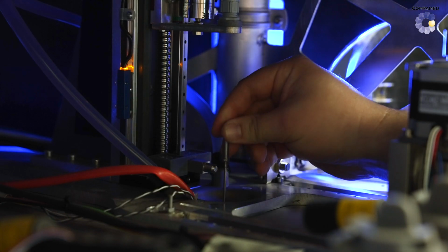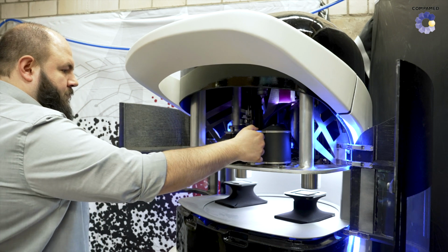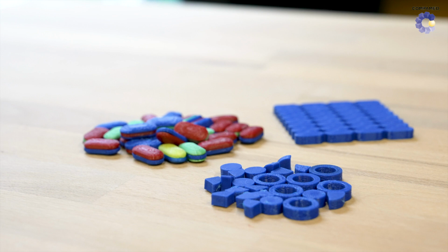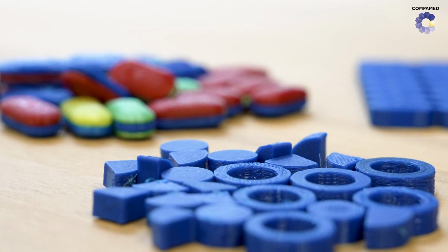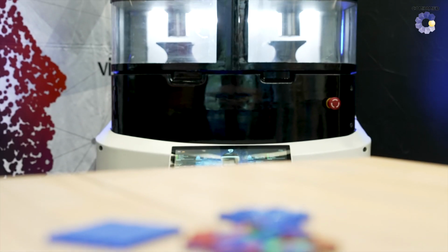Ultimately, we design parts that come into contact with the active ingredients in such a way that they can be replaced and accessed externally. Our tests have shown that we need around 5 minutes to set it up again so that we can continue. From a pharmaceutical point of view, the biggest challenge was to design the combination of active ingredients and the polymer as a carrier in such a way that the effect is targeted.